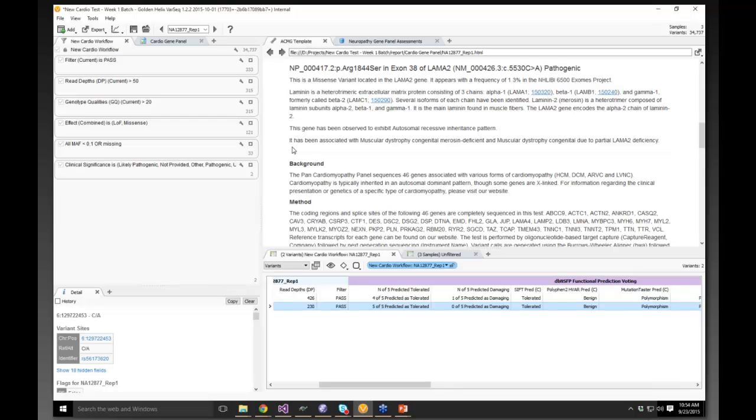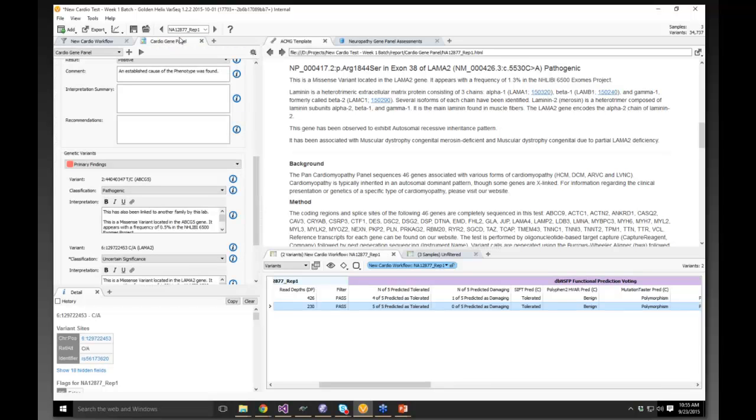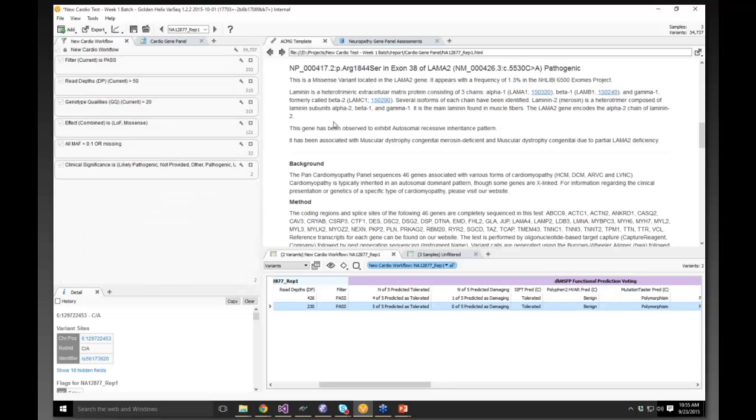The yearly license that you get, or you can actually get multi-year licenses if you want to lock in better rates or have that certainty on the price structure over time, covers things like VS Reports when you add that as an add-in to your license, and there's no further per user or per sign-out level monitoring. And in fact, all this happens on your machine, so we're not actually capturing or knowing anything about your volume.